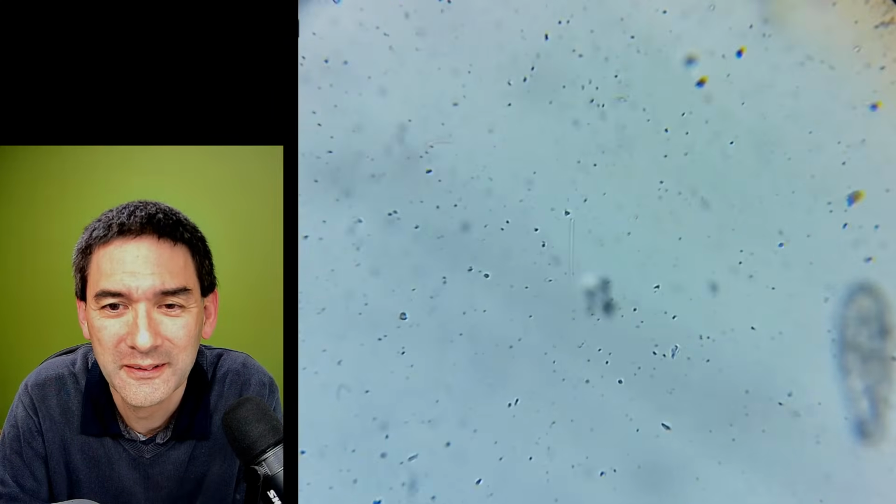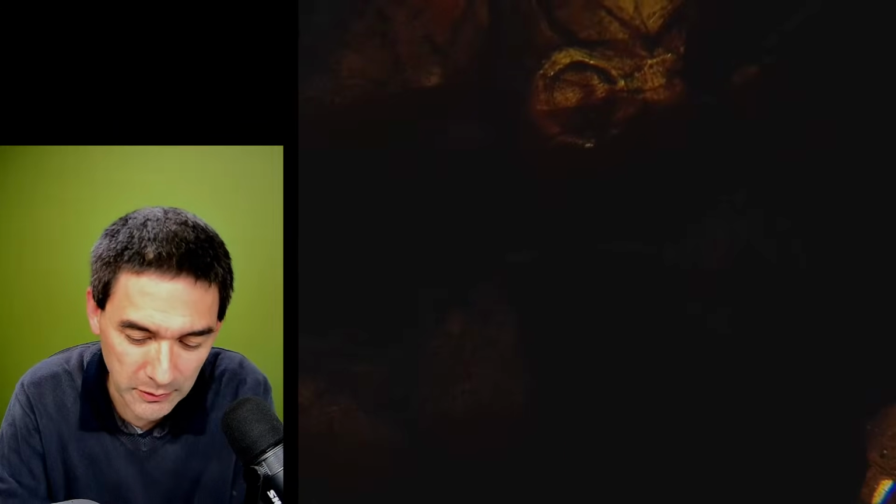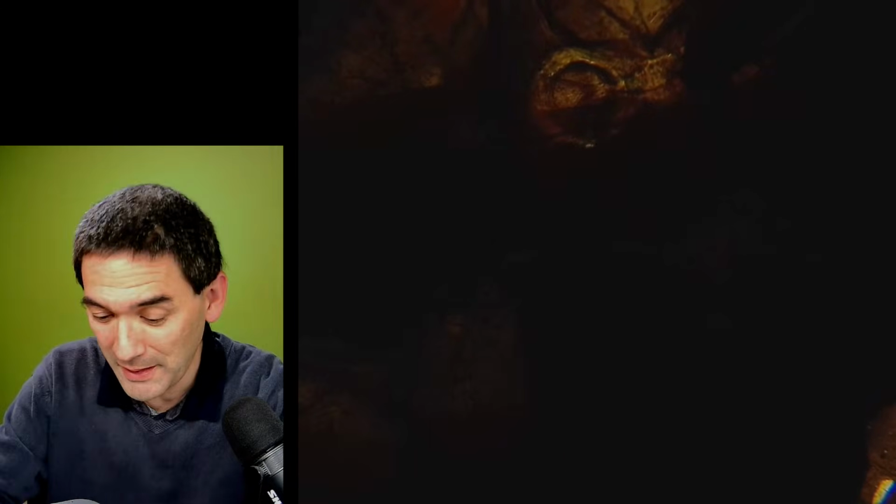So, more light. Let's have a look. You see, I'm currently running the whole thing on batteries, right? So let's see if I'm able to push more light. No, not possible. But what I can try to do is actually change the exposure. Let's see if I'm able to do that.